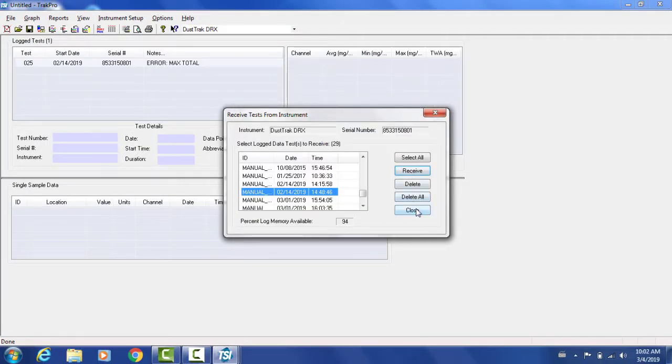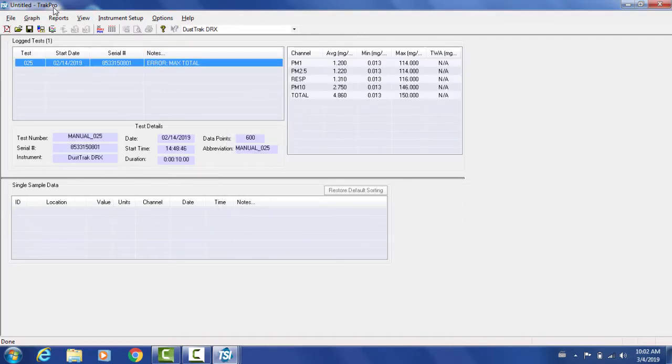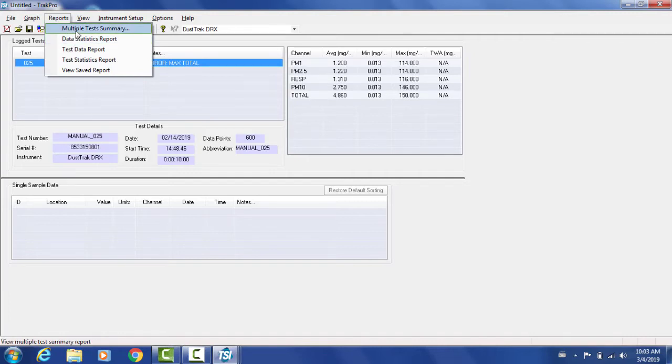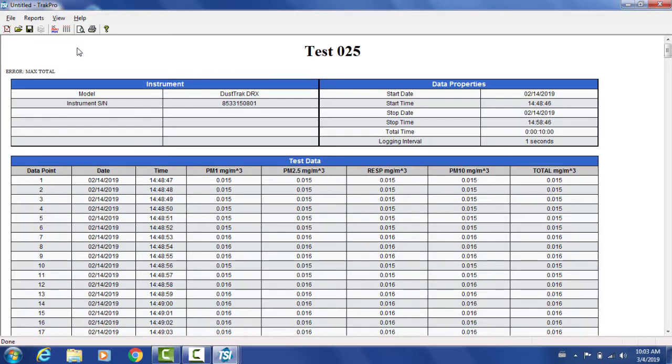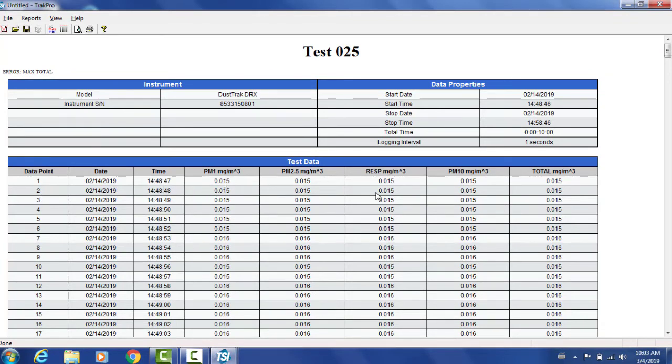Once this is done, I will go ahead and close. I also want to visualize my data. So I will go and select a test data report. The data report just displays all my data as it is. It shows the date, the time, the different mass concentrations, and all the different time points.